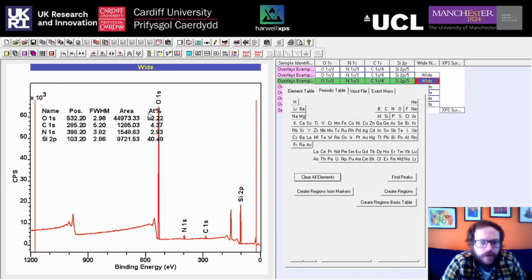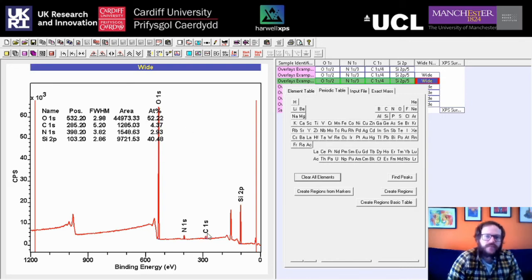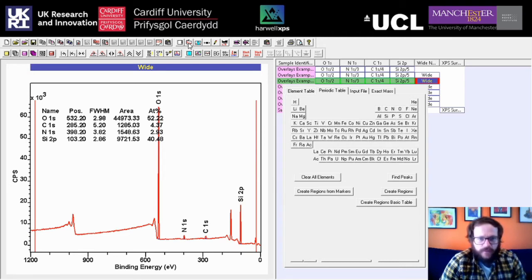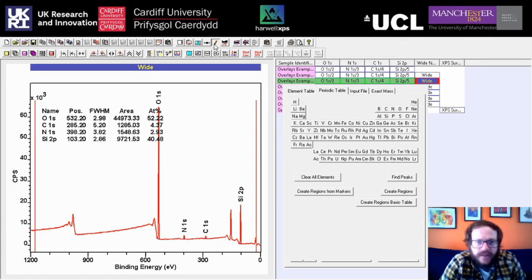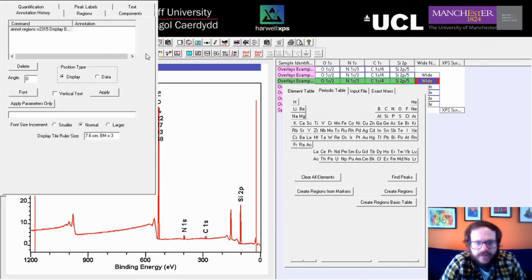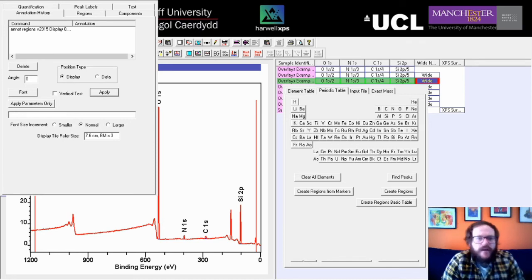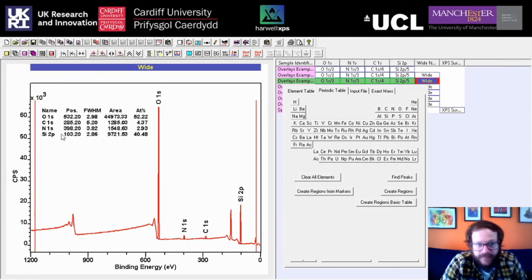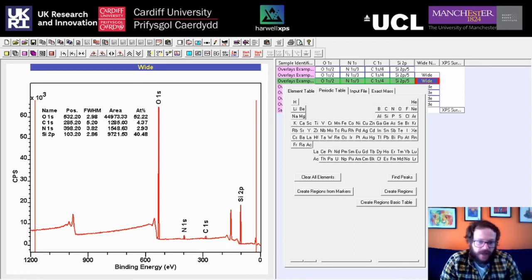We now have a quantification table based on the wide scan. To move the table so it doesn't overlap the peaks, go to Display Parameters and select Tile Annotation. We can change the font via Annotation History — select the annotation, click Font, reduce the size, and click Apply. Now we've got our text box somewhere it's not overlapping with the Oxygen 1s. This is very simple, very quick quantification based on the wide scans — likely the first thing you'll do when you get your data, just to check that everything is there and sensible.